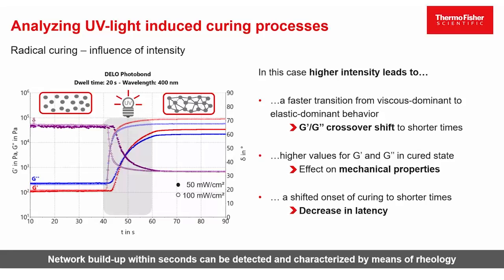And lastly, the latency is significantly decreasing as the intensity is increased. So all these three findings are indicating that rheology can be used to characterize the structural changes of such samples quite well.